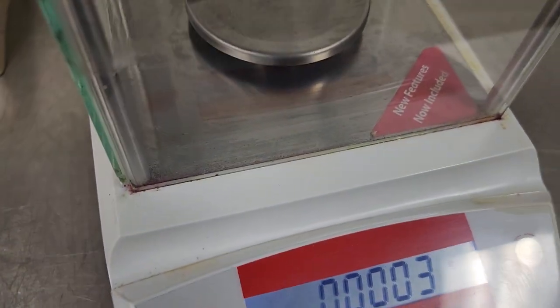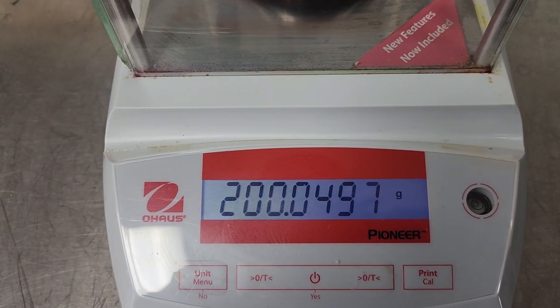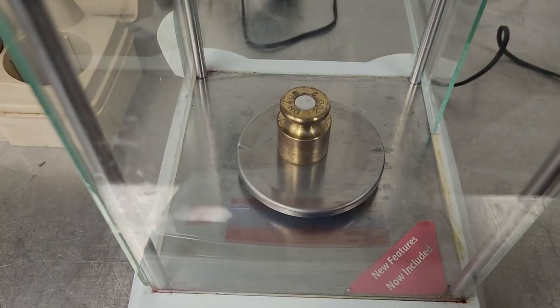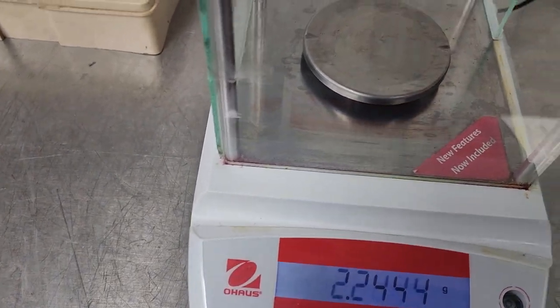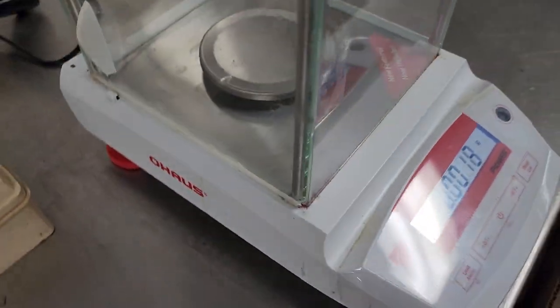We could try a little more weight. I don't know what this one is. That's 200 grams. I don't think I'm supposed to go any more than that. Not sure what else to show you.